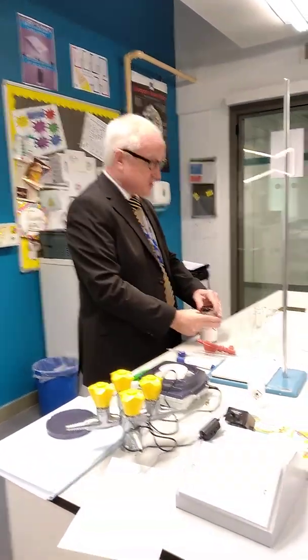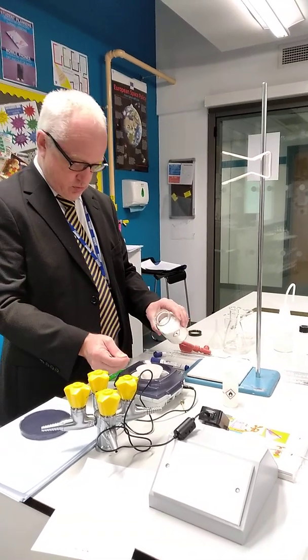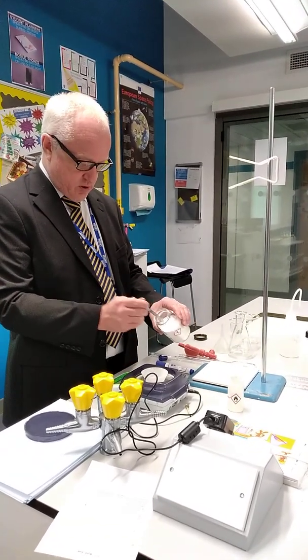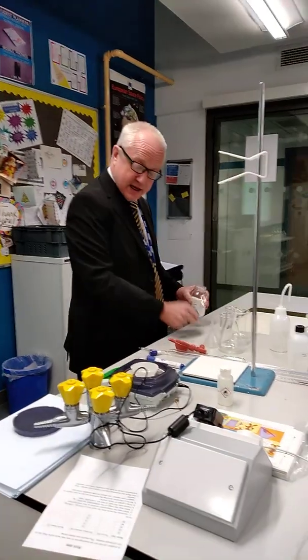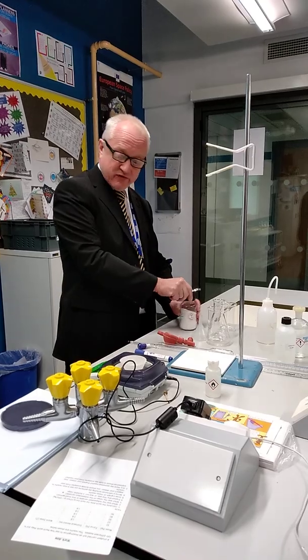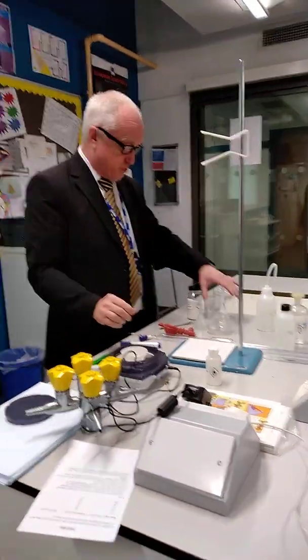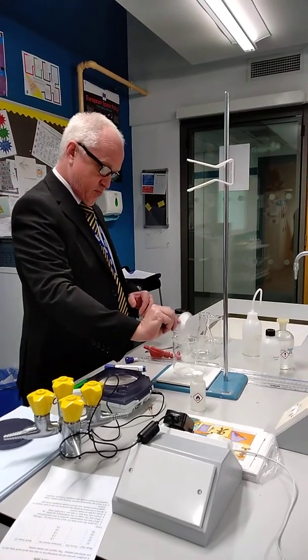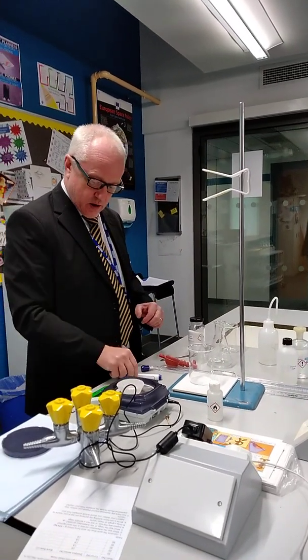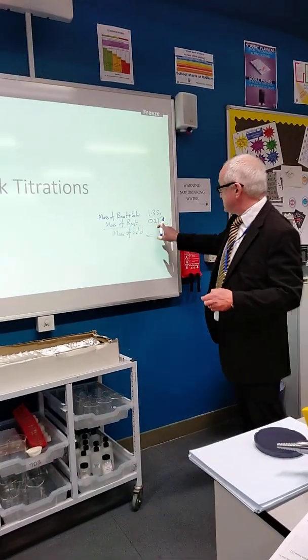Now I'm going to add in approximately one gram — it's a couple of spatulas by the looks of it. Mine has come out at 1.35 grams. So then I'm going to pour that into a beaker and put it back on, and it's come out at 0.27 again. So I'm fine.